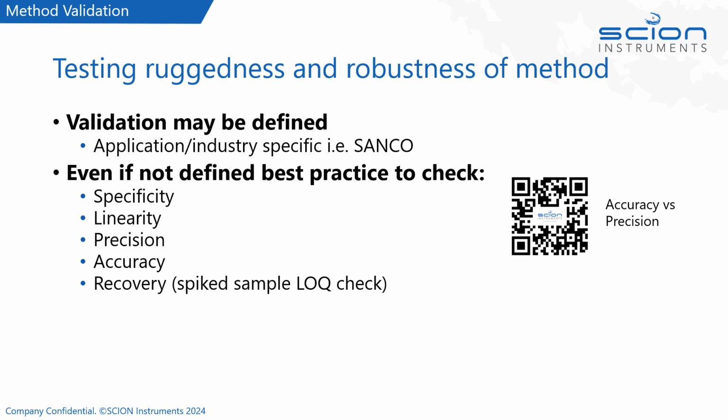We'll be looking at the precision, so how repeatable is our method. So we would run multiple injections, repeat injections of the same sample, and we would check the RSDs for each target analyte. We'd also be checking the accuracy, so how close is it to the true value.